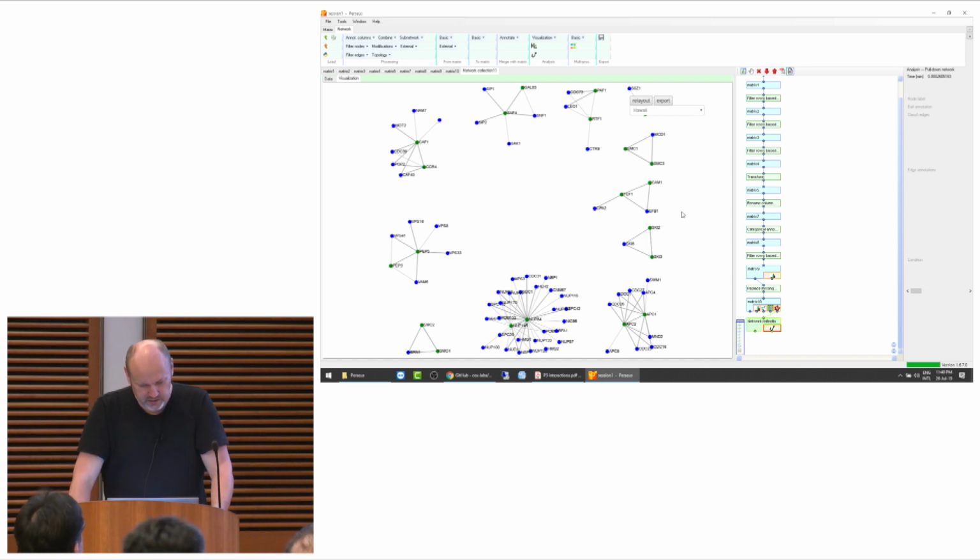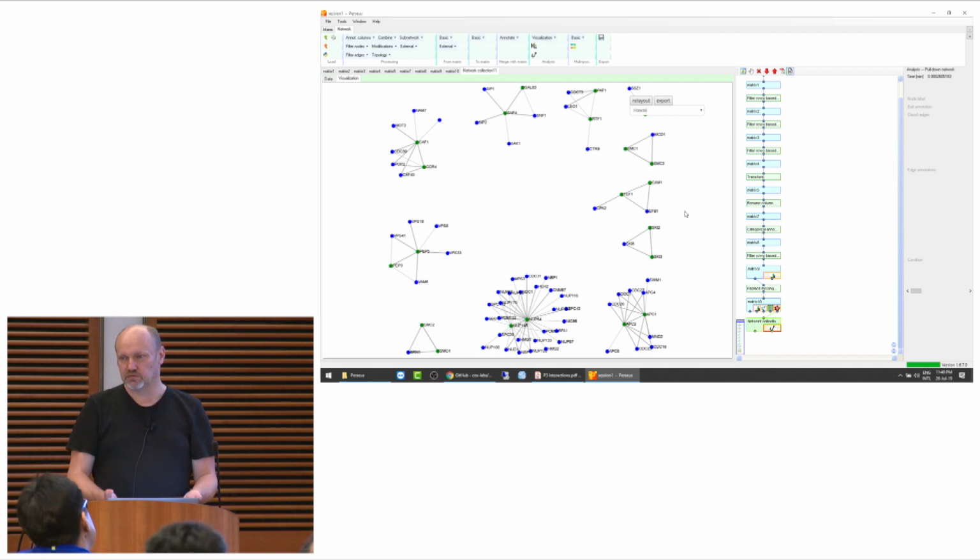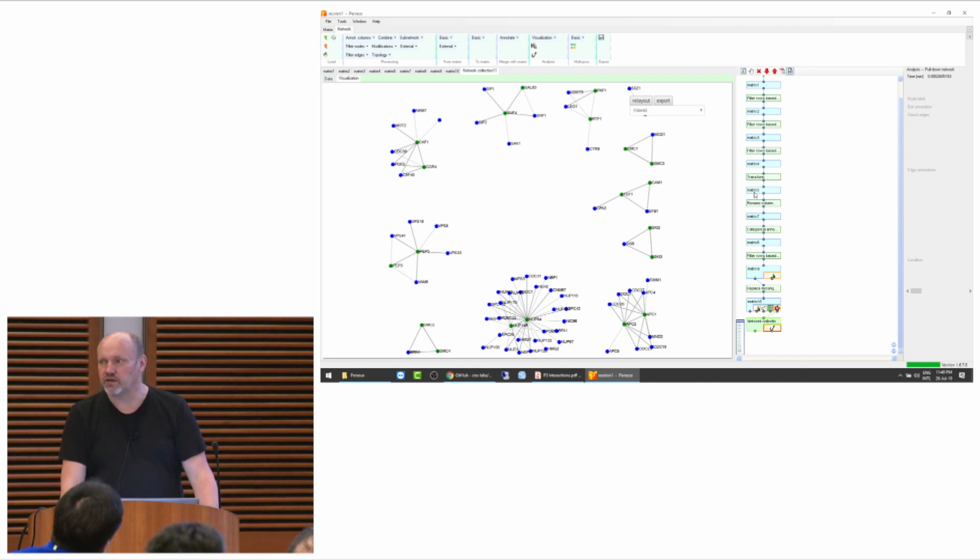Right, so that's basically giving you a representation of the interaction network. And yeah, that's it. That's what you wanted, basically, right? So from quite big pull-down data sets, it's now actually pretty straightforward to get to figure 1 of your paper, basically. Any questions to that?